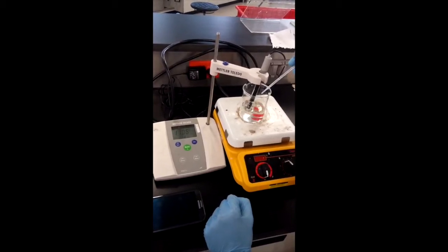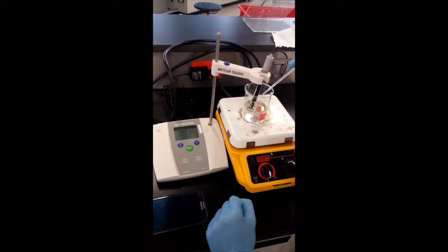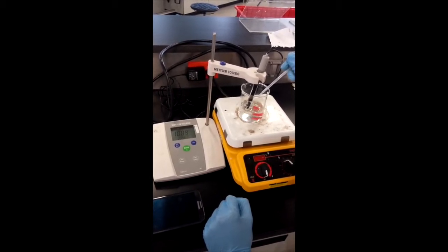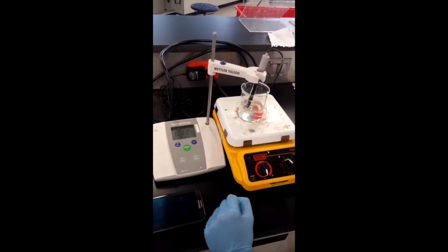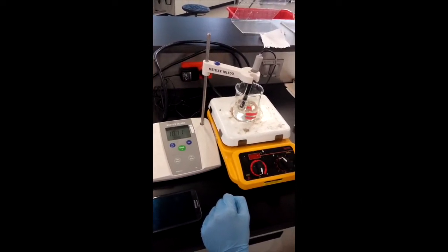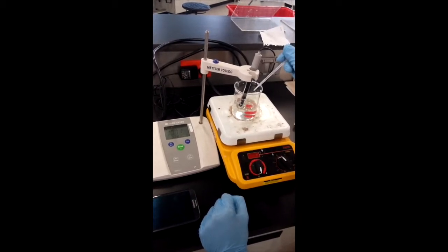So, a highly concentrated solution of hydrochloric acid, 5 molar, was added while reading the changes in the pH as drops were mixed in a beaker being agitated with a magnetic stir. When the solution reached 8, the volume was measured in a graduated cylinder and it was approximately 98 milliliters. Water was added to get to the 100 milliliters mark.